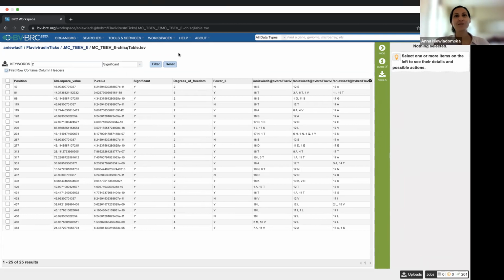Right. So it really depends because bacterial and viral pathogens differ so much in terms of their size. I mean, you have a 10 kb RNA virus, or you have a 400,000 base pair plasmid. It's not going to be the same in terms of your input data size. So we're really trying to find the sweet spot and kind of customize it for each species. It really depends, and we're still working on it. But we're trying to find a solution that makes sense for every species.